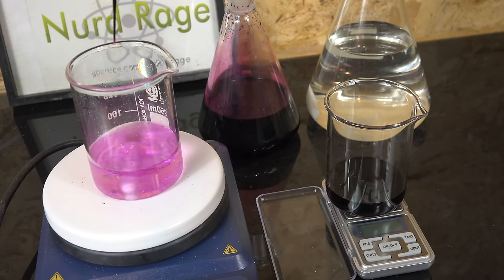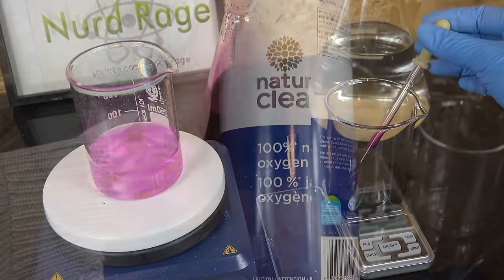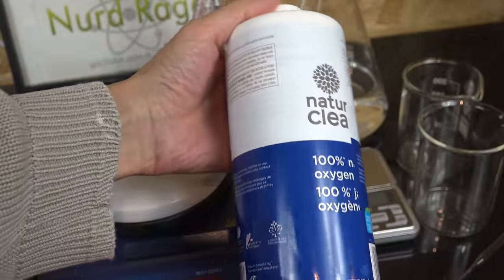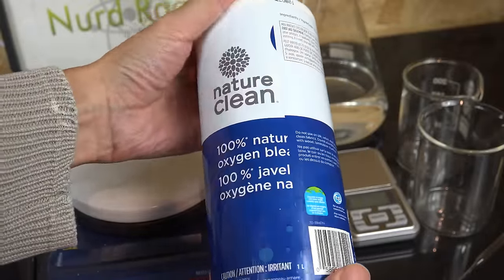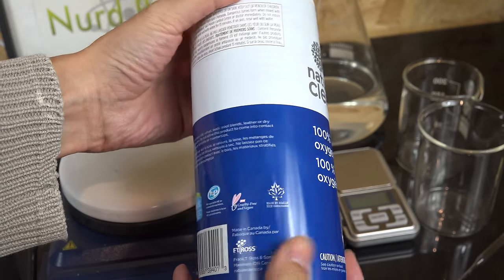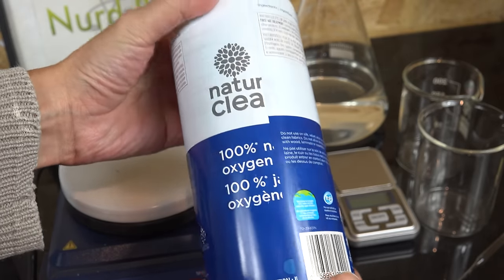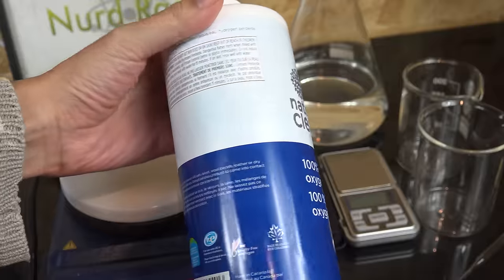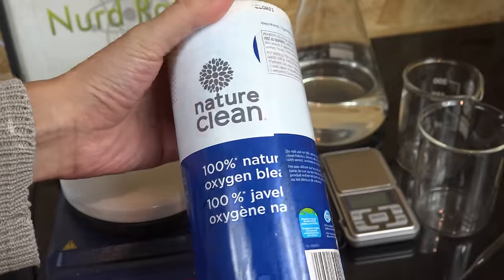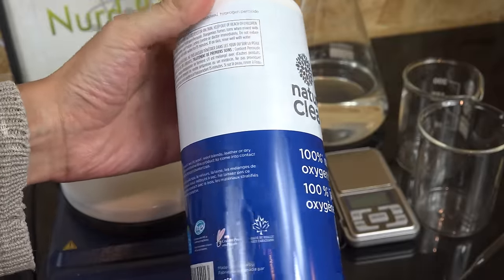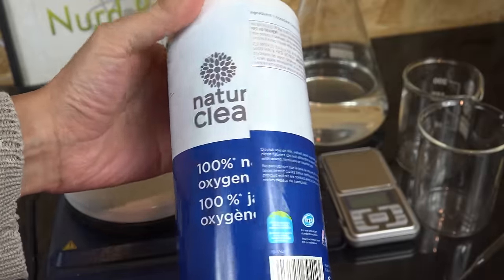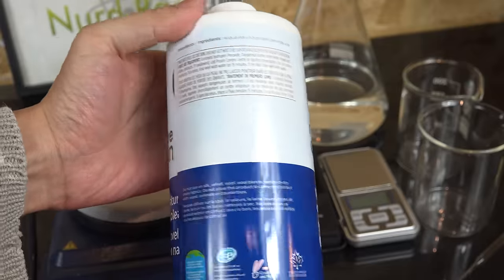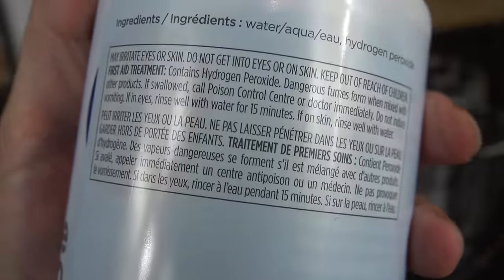But at least you don't have to deal with unruly customers. So I have here a bottle of so-called oxygen bleach. It's actually hydrogen peroxide and is advertised as an eco-friendly alternative to chlorine bleach. For amateur chemists like us, this is a cheap and readily available source of hydrogen peroxide.